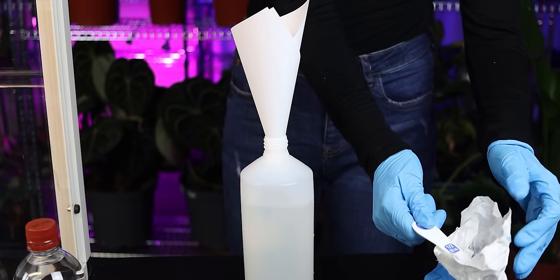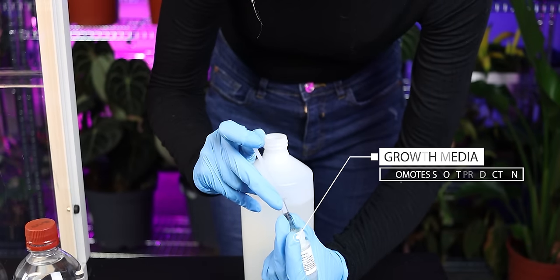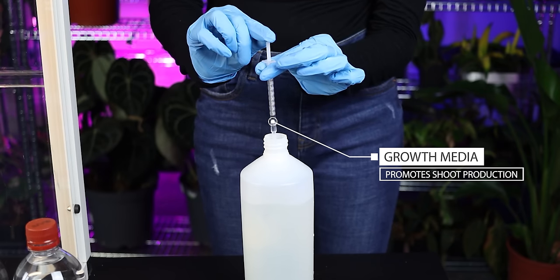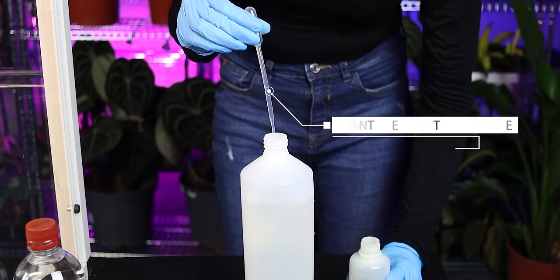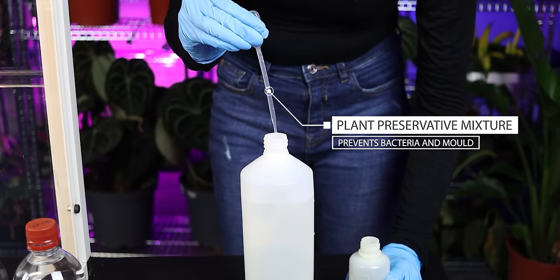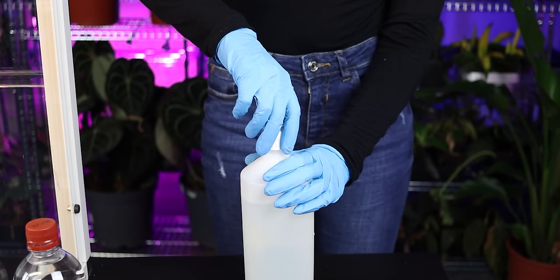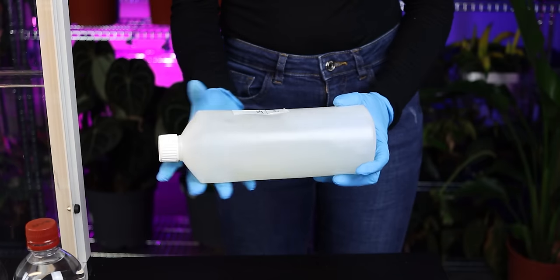To this, we add a little carbohydrate in the form of everyday sugar, growth hormones, and plant preservative mixture. Plant preservative mixture, also known as PPM, is antimicrobial, which means it helps prevent any potential fungus and bacteria growth inside our tissue culture containers. Once this is mixed, I'm giving the solution a quick shake in order to thoroughly mix the ingredients.